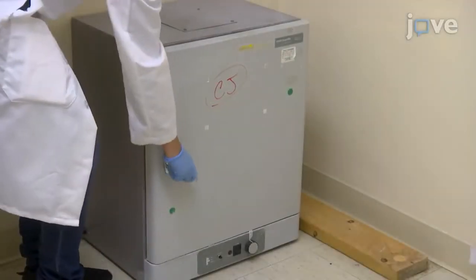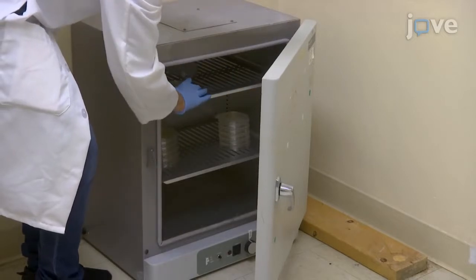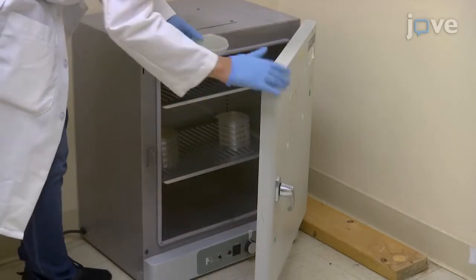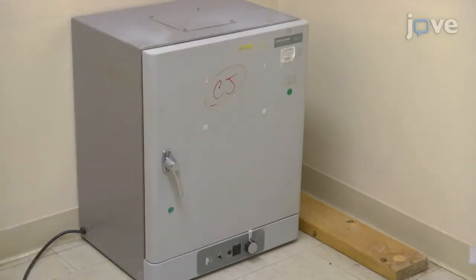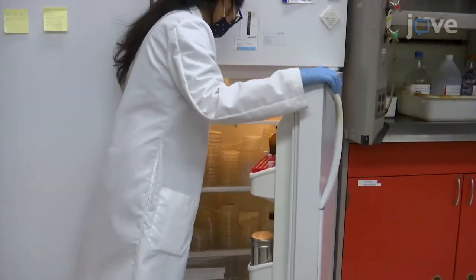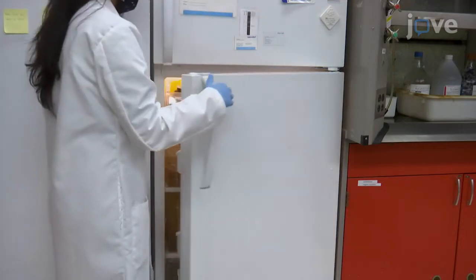After 16 to 18 hours, take the plate out of the incubator and leave it at 4 degrees Celsius for about 5 hours to let the superfolder green fluorescent protein, or SFGFP, develop for a more intense green color.